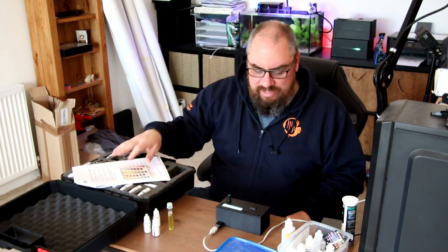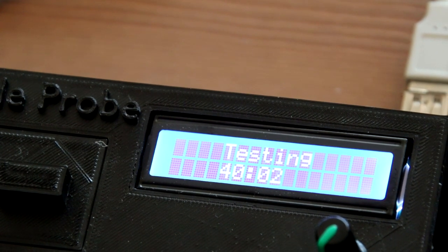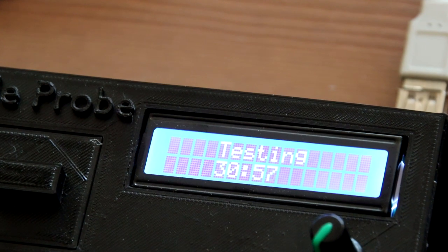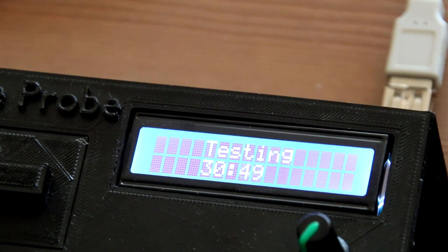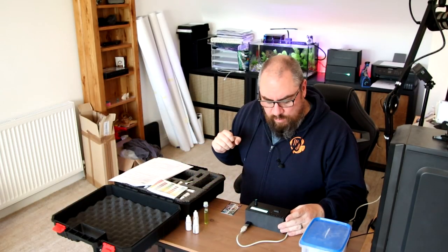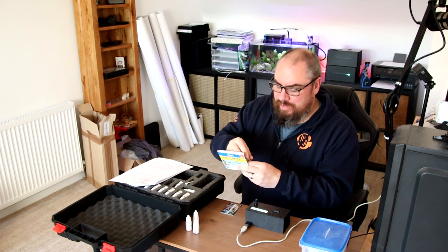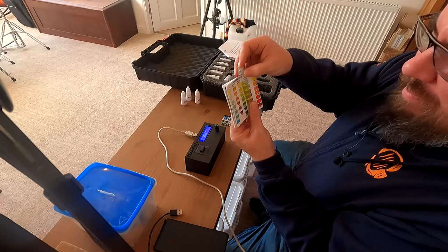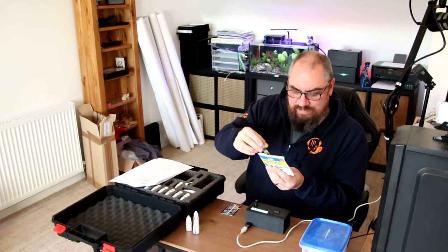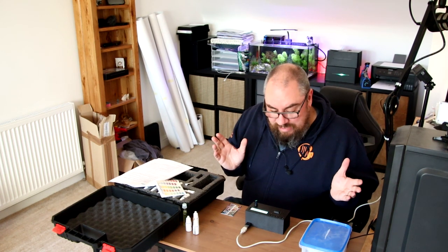With the ammonia API test we're looking for the sample to remain that shade and colour — to me that matches up with zero, which is what we want. I've never actually done the ammonia test with the Diode Probe. It's obviously not the fastest test, but if it can be the most accurate and not rely on me comparing colours, I think removing the human element altogether will give a much more accurate picture. Interestingly, when it got down to about seven minutes, the timer shot up to 70 then 60 — I think it's just a programming error, displaying '30' instead of '03'.